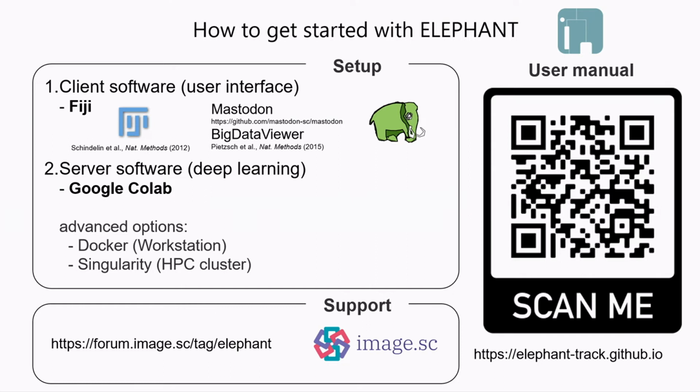Then the server side, which does the deep learning, can be set up using Google Colab. Or if you have a powerful GPU workstation or an HPC cluster, you also have those options. All of those steps can be found in the user manual, so please visit here to get it.